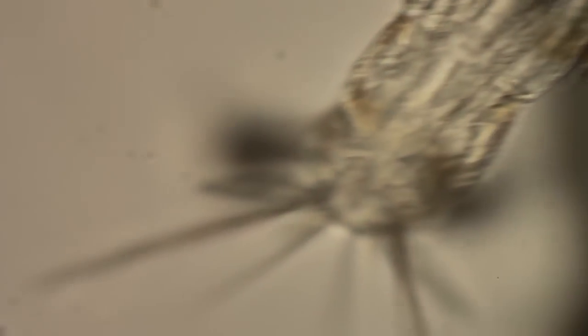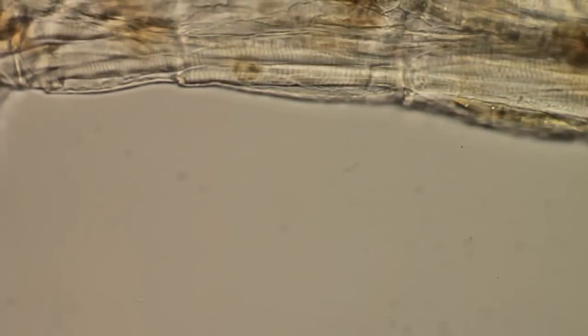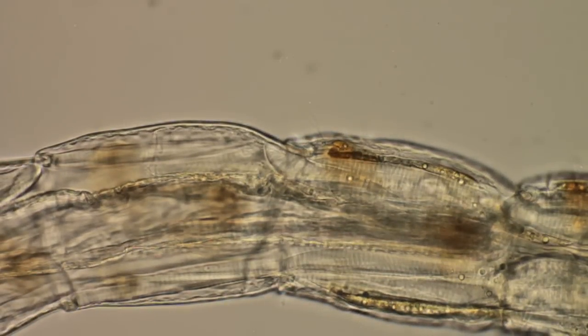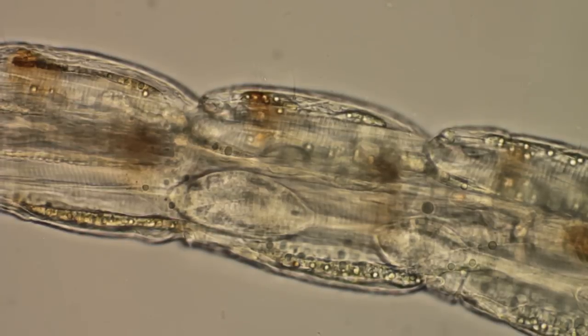Let's see him clench those toes up. That's a spine there — two of those, two of the short horns. It's hard to keep under the lens. Look at those claws on the toes — see them clench? That's cool. Every one of these larvae has got a different tail. Look at the bladders in the body there. I think they're buoyancy bladders, but I'm not sure. I don't know what else they could be.